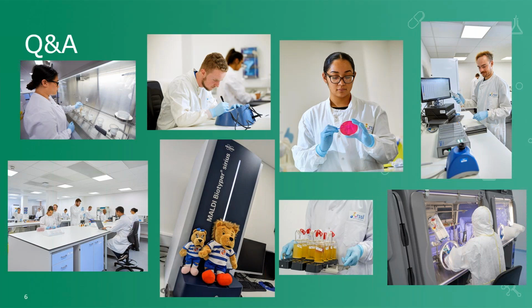Okay, and I have a question from Jane, and she says, why do we need to use spiny spores in disinfectant validation? Okay, that's an interesting one. So first of all, there's a big difference between the European and US approaches. The European fungal sporicidal disinfectant standard changed to say that you need to use spiny spores, where the US standards make no difference.